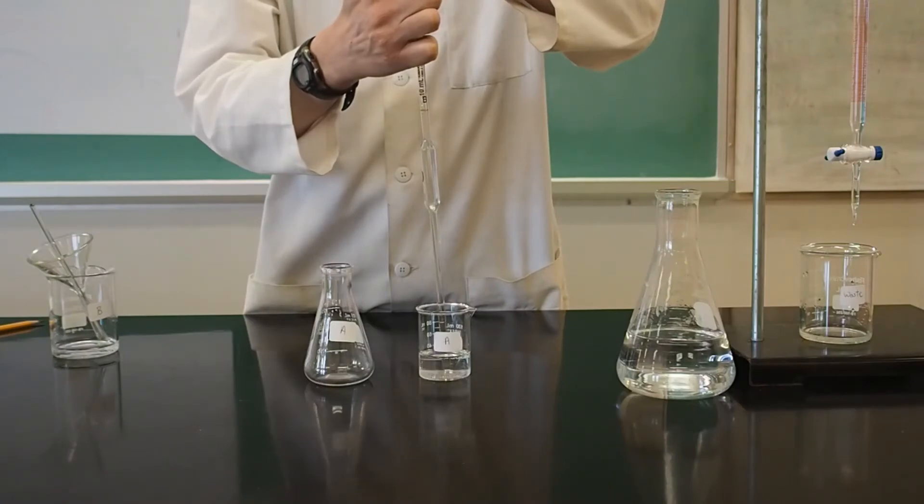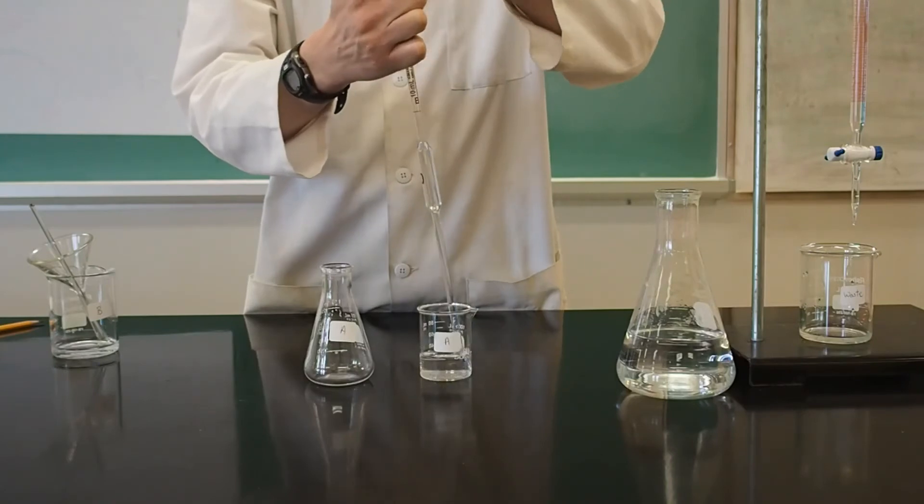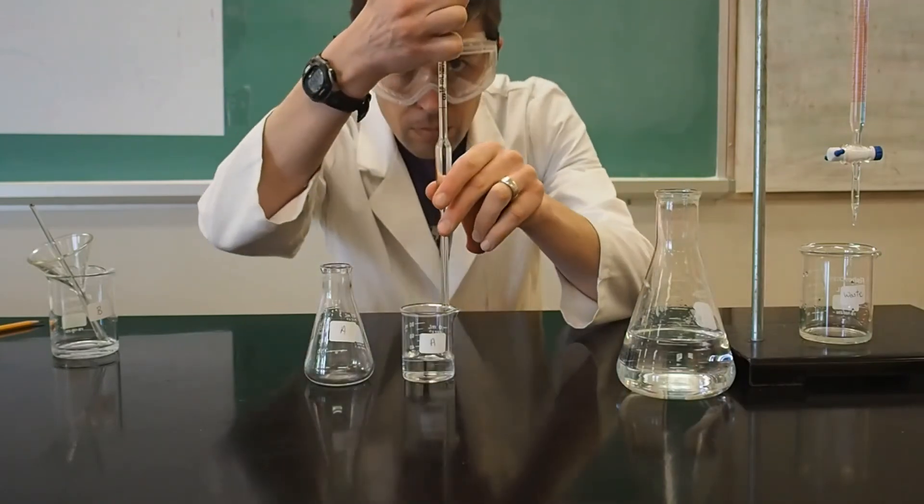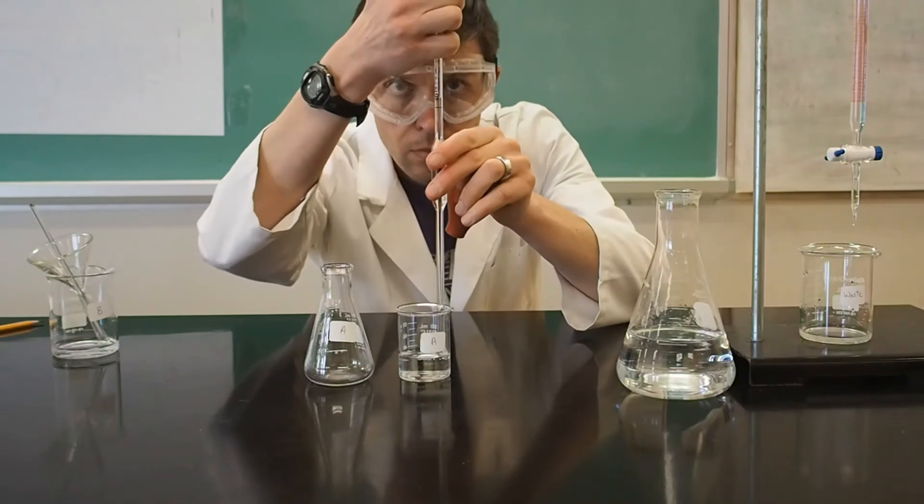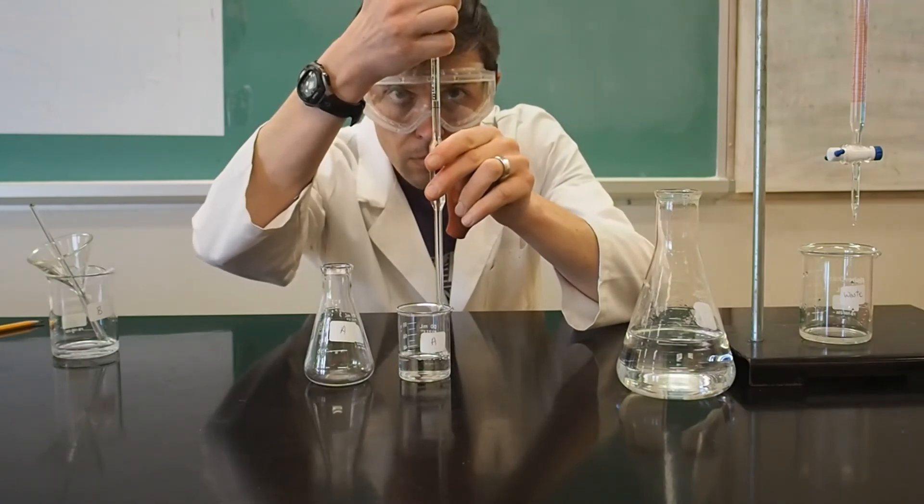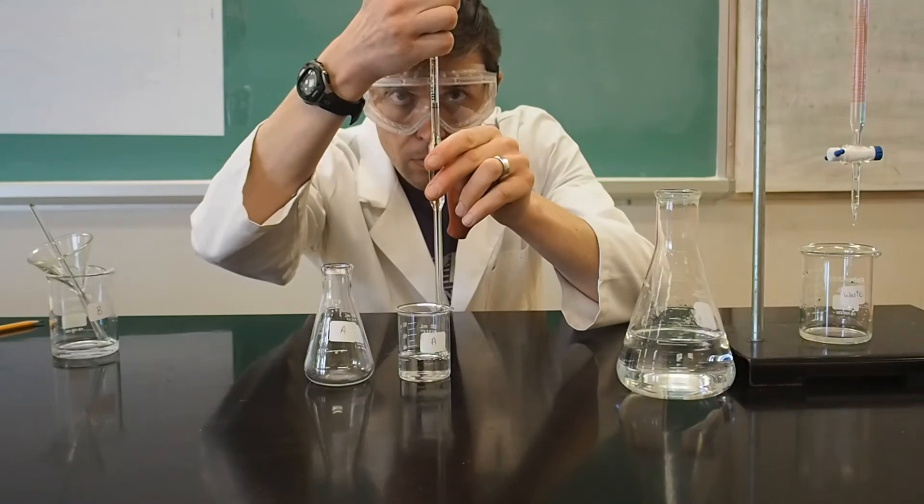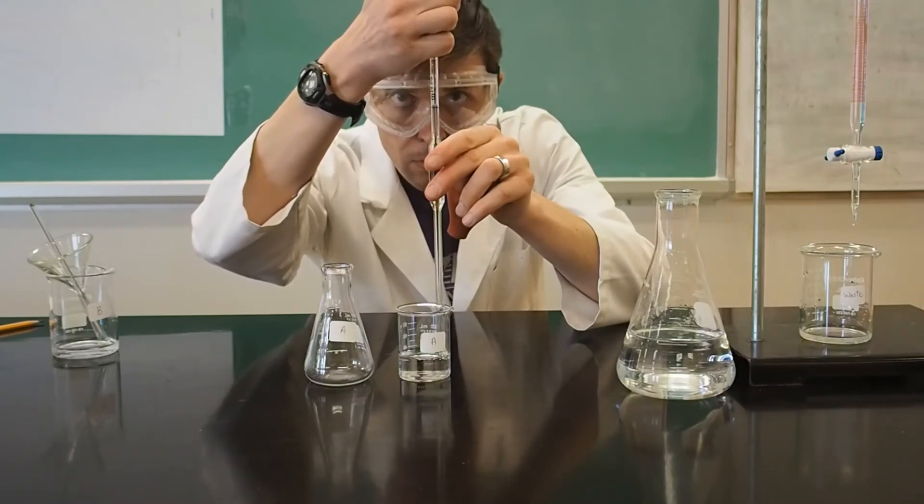Now take an aliquot using the method described. The success of your titration depends on ensuring that the correct volume is transferred. Do not transfer if you are not precisely on the fill line. Start again as needed.